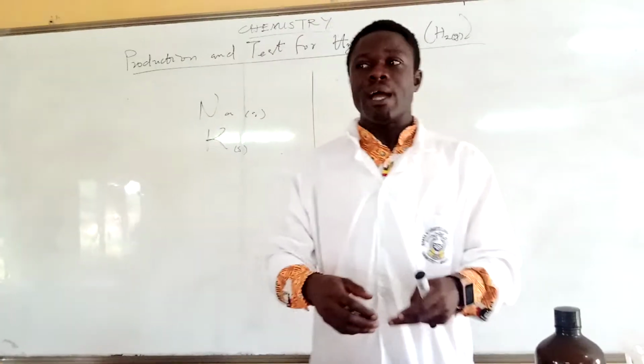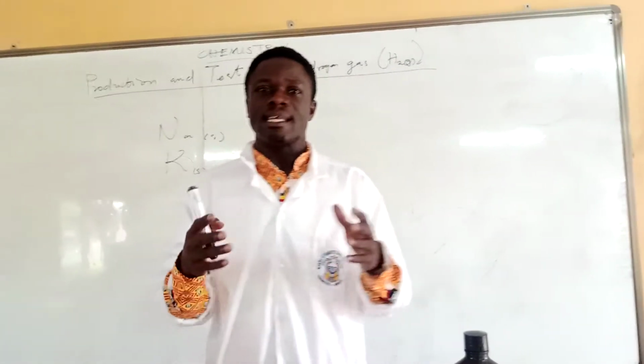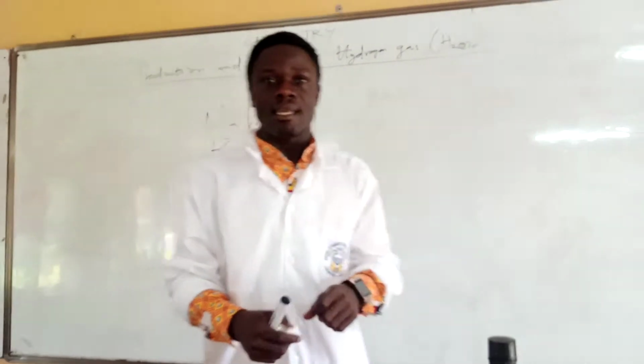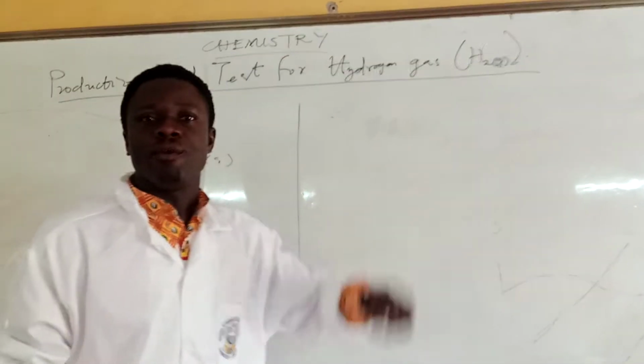Viewers, today we are going to look at the preparation of gases and how we can test for such gas. But today we are going to concentrate on the preparation of hydrogen gas and the testing of hydrogen gas. So our topic for today is preparation and test for hydrogen gas.